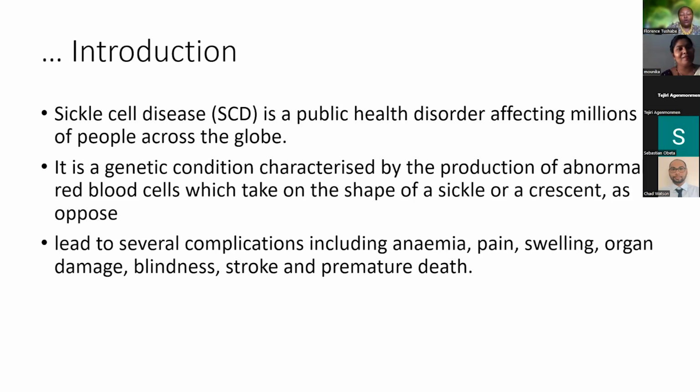As we all know, artificial intelligence cannot work without good data. Right now our project is on sickle cell recognition, which we have done, and currently the recognition rate is at 95%. But we are yet to publish that. First, we had to create a data set. That's what I'm going to share with you today: a data set of normal red blood cells as well as sickle cells.